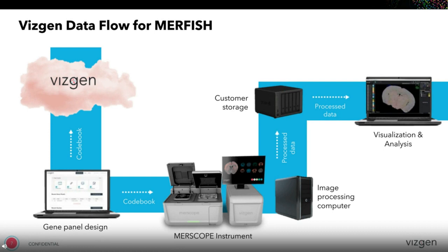With that, the instrument will automatically acquire the data and then transfer the data to the image processing computer for analysis, as illustrated by the data flow for MERFISH here on this slide.